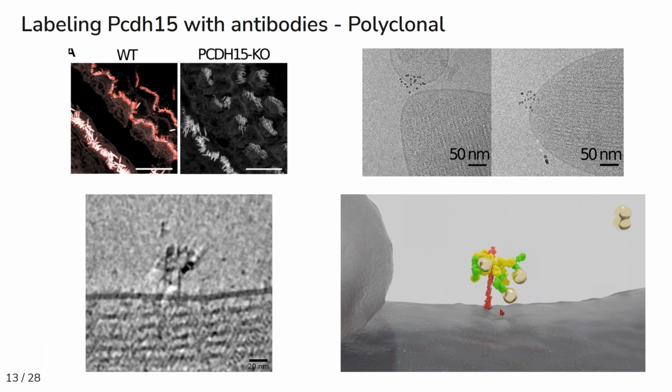And on the right is our artistic interpretation of that. The problem is that the protocadherin 15 molecule gets surrounded by many different copies of the polyclonal antibodies, which then get bound by multiple copies of the secondary antibodies, which are then labeled with gold. And that makes it very hard to interpret what's going on. So we knew we had to find a better labeling agent.